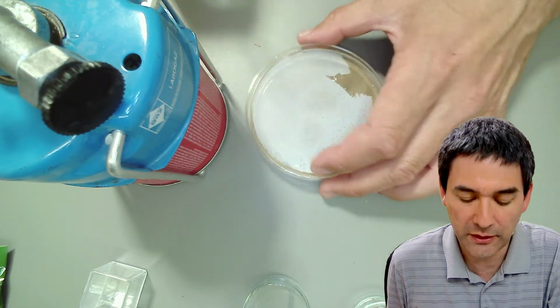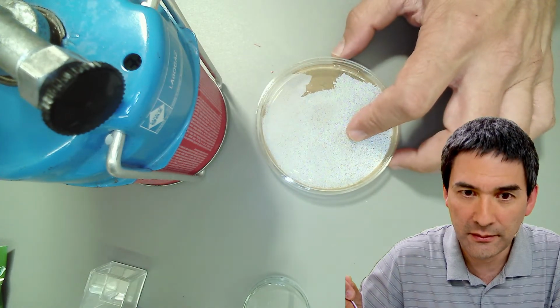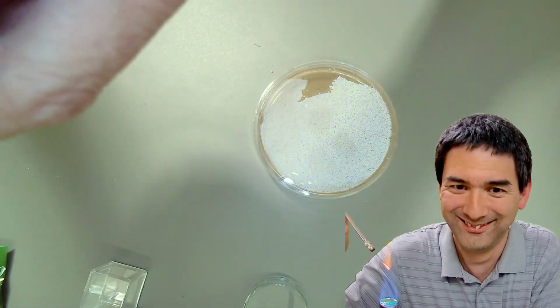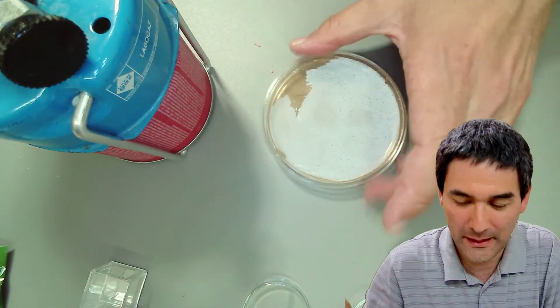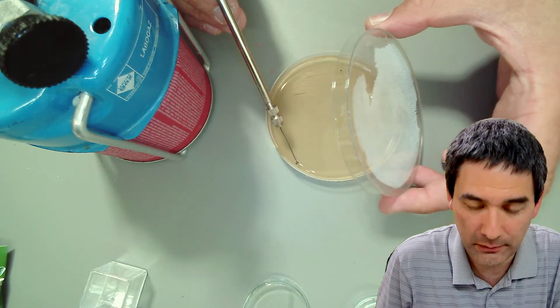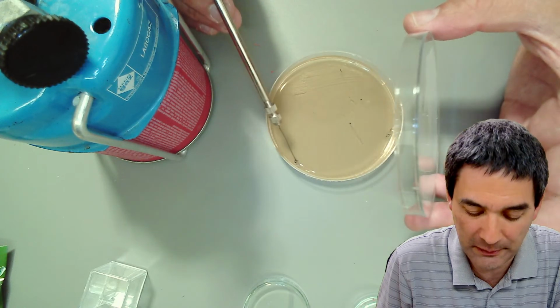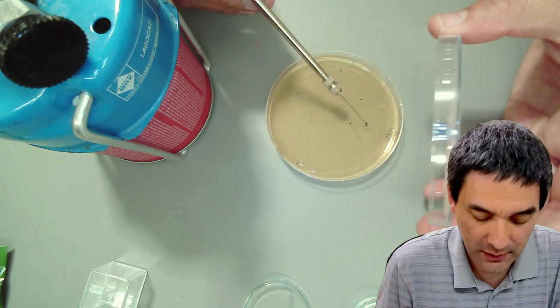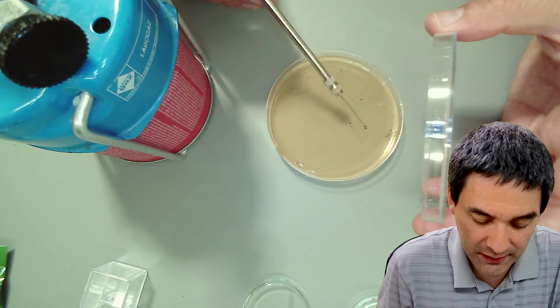You always have to be careful that you don't scratch the surface. Yeah, I'm glowing it out again. Okay. Get the idea? Yeah. And then I put it again into the cold agar medium. And this also kind of cleans off a little bit the soot and the black, burned material. I go again into the previous one, a streak out, and I spread it again.